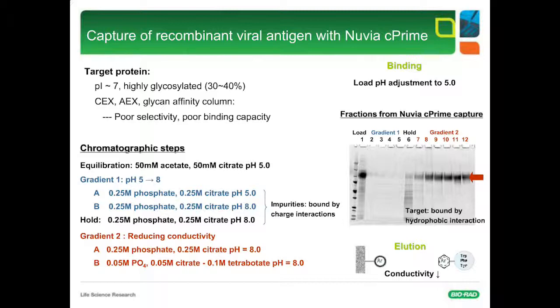So they're wondering if you have any comments on how to reduce the tailing, or if you could explain it. First, I want to emphasize that for the base beads we use for making this new resin, we've already optimized the structure, the particle size, and the surface properties. So we don't often see tailing of elution. The eluate can always be collected within 3 to 5 column volumes.